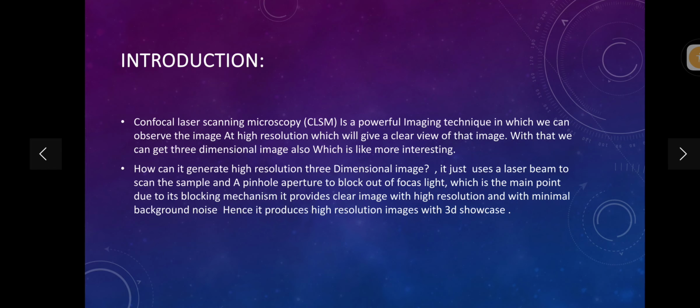It will scan the sample fully, and we use a pinhole aperture, whose function is that it just allows the focused light and directly blocks the non-focused light.